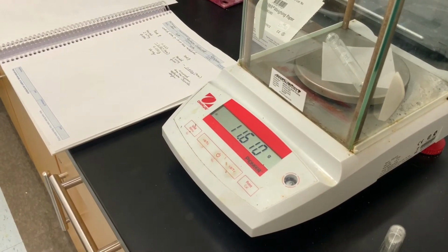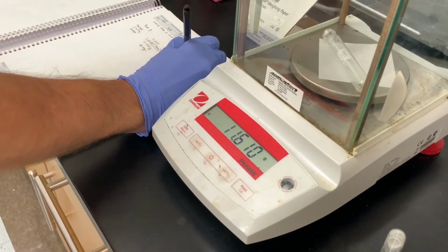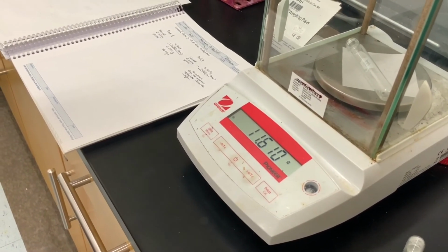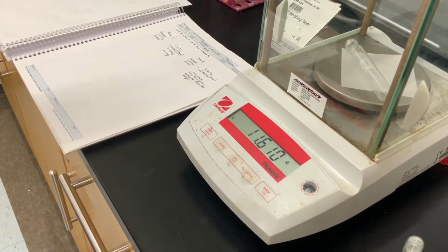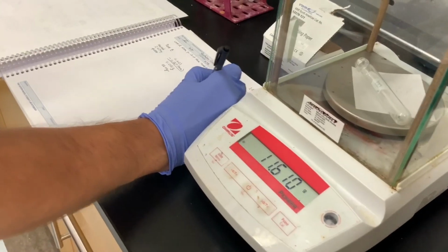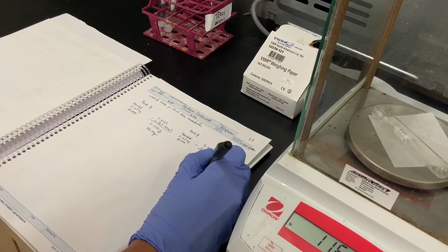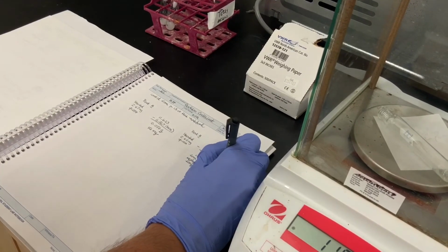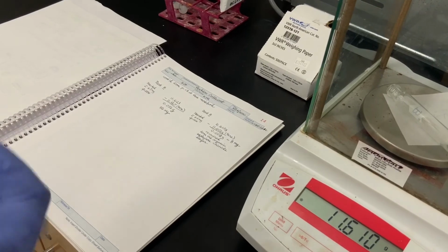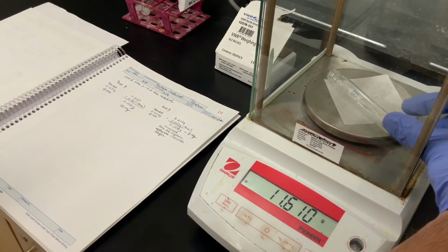So 11.610 minus 11.602, the tare weight, equals 0.008 grams, which is 8 milligrams. So clearly, very little recovered from test tube B, part B.